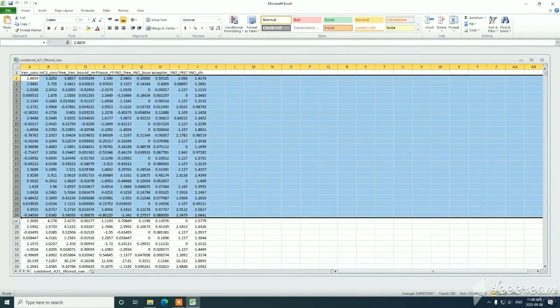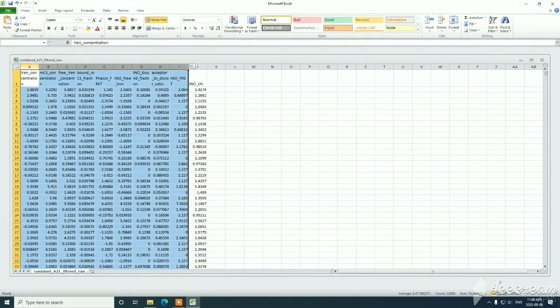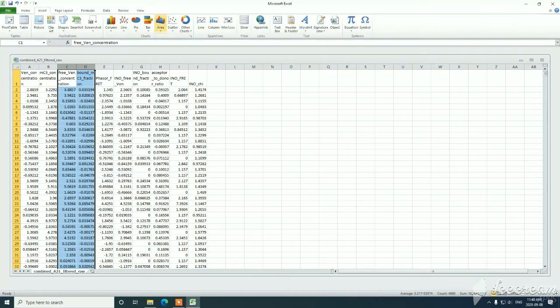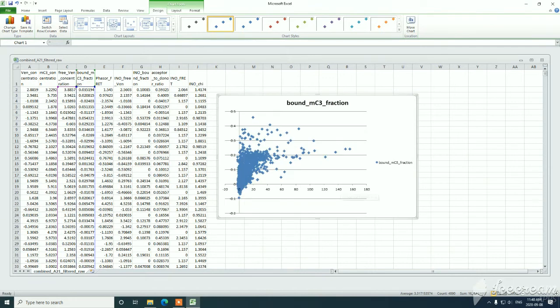For each region of interest listed in the rows, we have several features which we've exported. Total concentrations are listed in A and B, whereas free Venus in that ROI is calculated in C. By plotting columns C and D, we can generate our binding curves as shown in the paper.